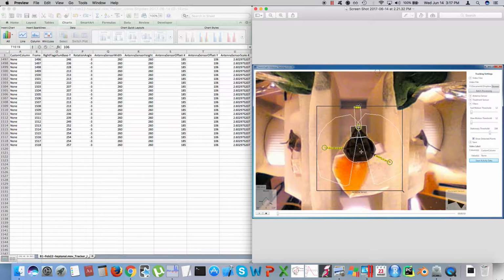Then, because you know the rotation angles, it's possible to compute the angle of the antenna relative to the front of the head, regardless of which way the bee head is being rotated. So as long as you correctly position the widget, rotate it and scale it, the software will be able to compute the angles towards an odor source correctly, or relative to the head at least.